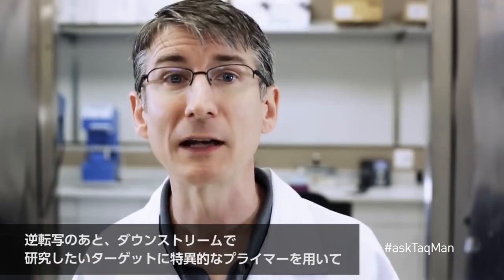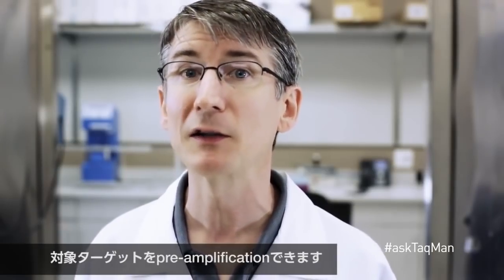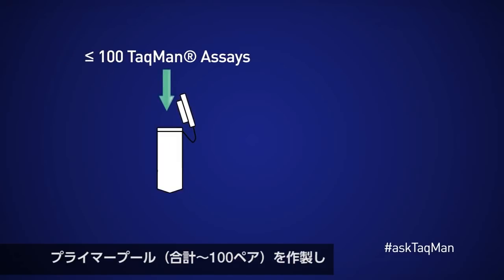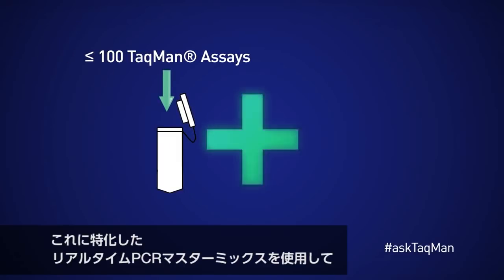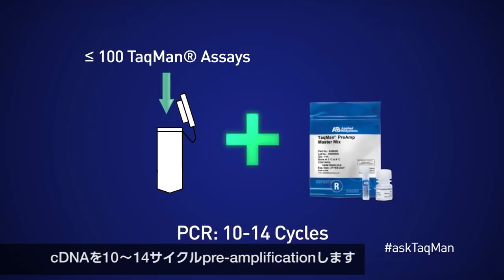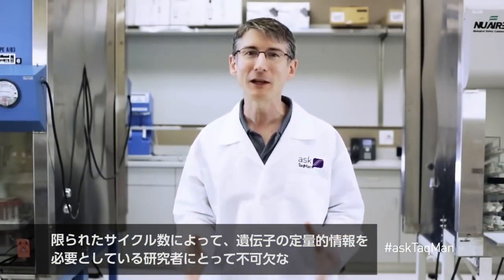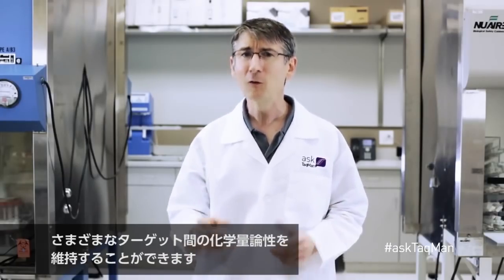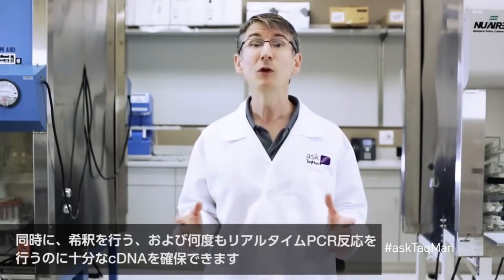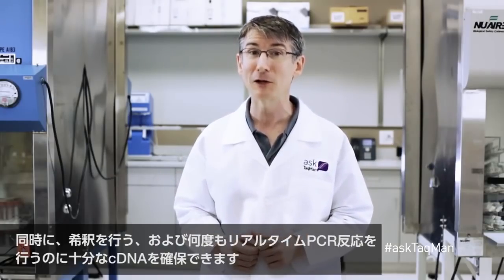Following the RT step, we can pre-amplify our targets of interest using primers specific to the targets we wish to interrogate downstream. We do this by creating a pool of primers — up to 100 pairs in all — that pre-amplify the cDNA using a specialized real-time PCR master mix for anywhere between 10 to 14 cycles. This limited number of cycles ensures that we maintain the stoichiometry among our various targets, critical for researchers needing quantitative information on their genes. We wind up with plenty of cDNA to perform a dilution as well as to carry out numerous real-time PCR reactions.